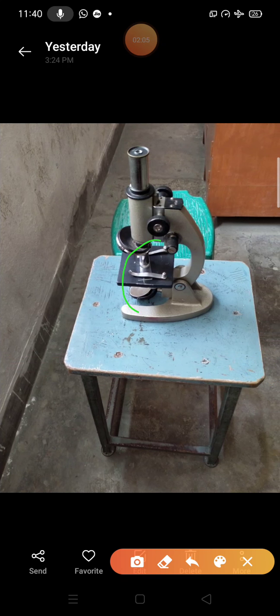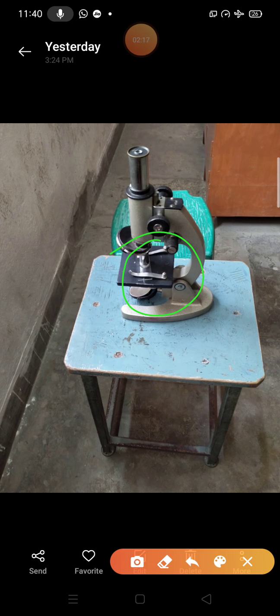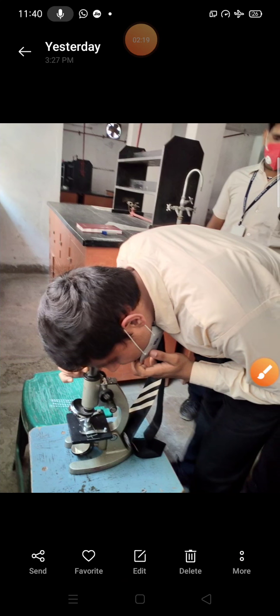Here, the clips adjust and fix the slide under the microscope. And this is the right way to study a permanent slide under the microscope.